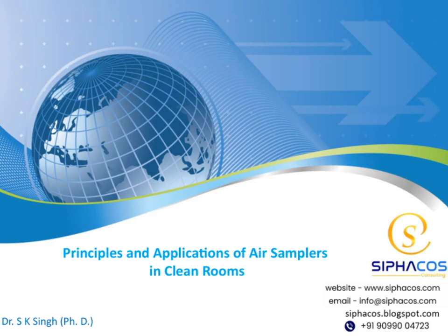Today's presentation is on principles and applications of air samplers in clean rooms. We'll explore how air sampling works, why it's important, and the various applications in maintaining sterile environments. So, let's get started and dive into this interesting topic together.